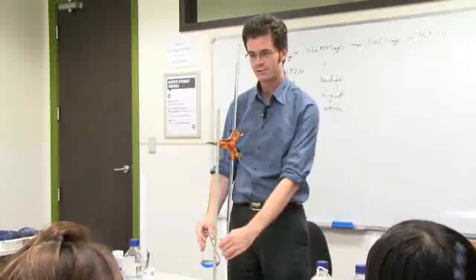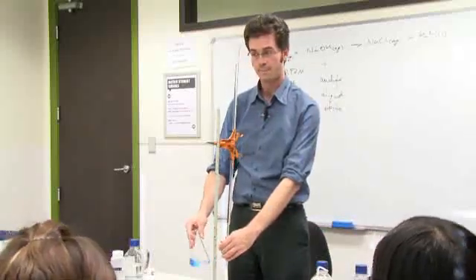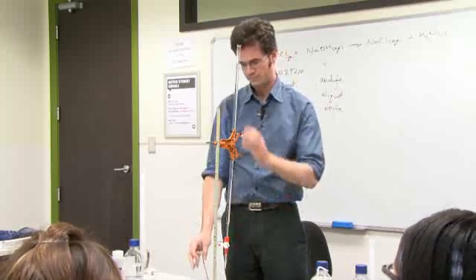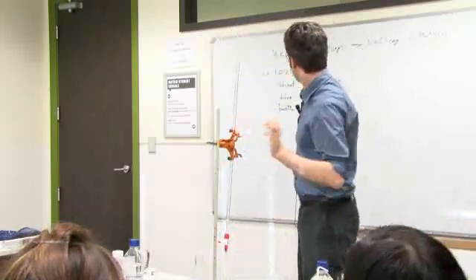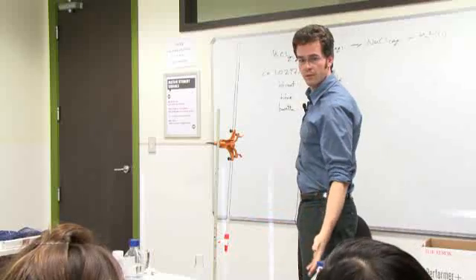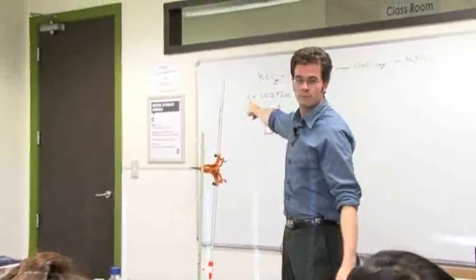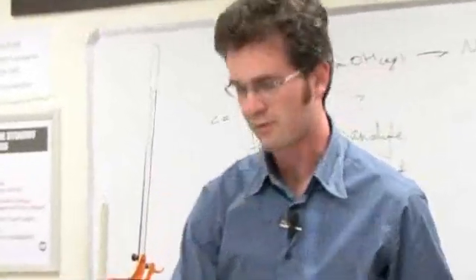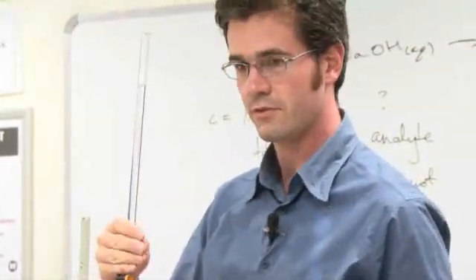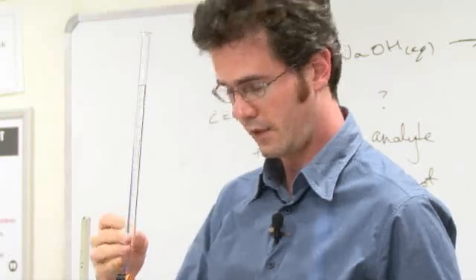You can control easy, it's protective, and you can swirl. Now, if we look at this over here, this we're assuming is roughly one mole per liter, and that's one mole per liter. So if we have 25 mils of our analyte, we would expect to use roughly 25 mils from our burette.